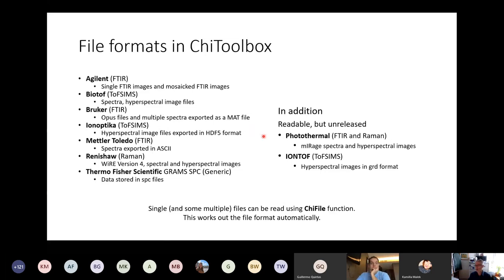Peter Gardner recently took ownership of a photothermal mirage system, and so we can read those files also. That's not in the released part of the code, but if you happen to have one of those instruments, well, I guess we can just make that available to you. And the system will read those automatically. If you just give it a file, it will work out the file format and read it, and it will know whether it's infrared or Raman and it won't get them mixed up and all that sort of thing.